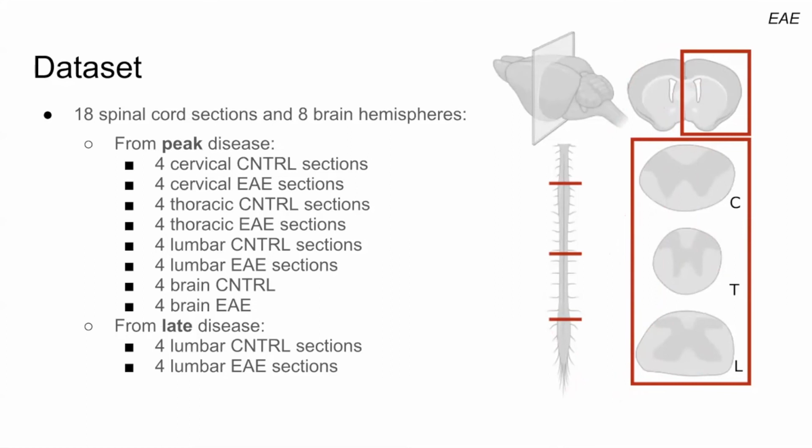It's great that there are tools out there such as ScanPy that we can use to actually analyze these cells, because that is one of the main upsides of using spatial transcriptomics. Not only can we treat it as single cells, by segmenting cells and then assigning spots to them, but we can also leverage the spatial localization of each of the single cells.